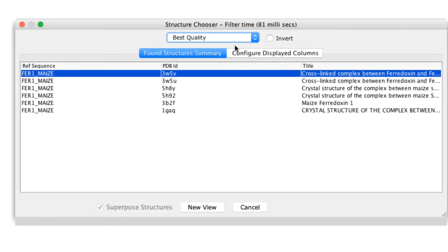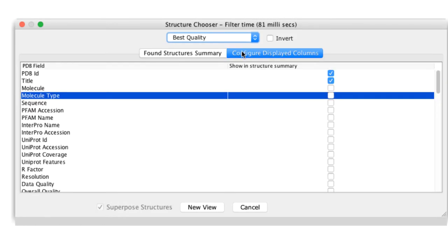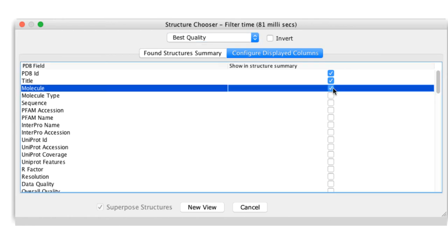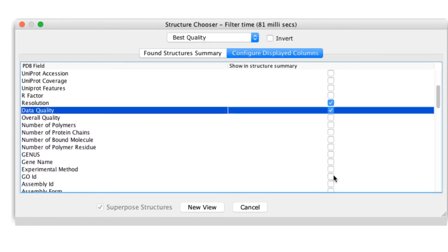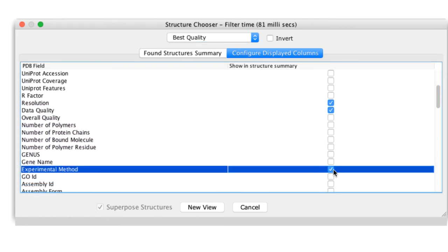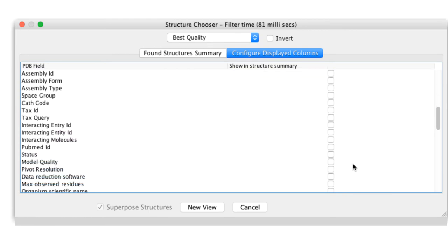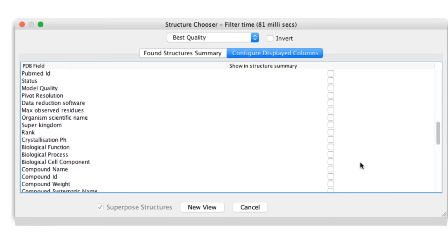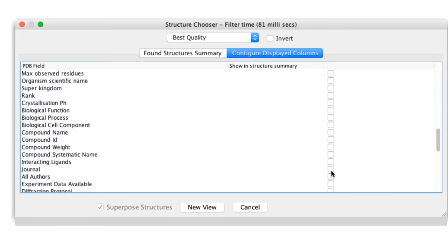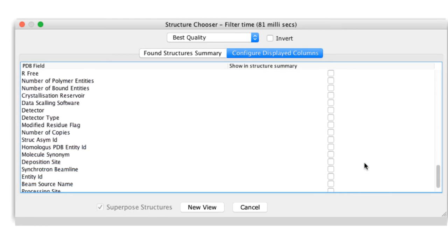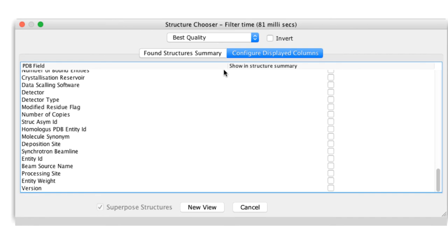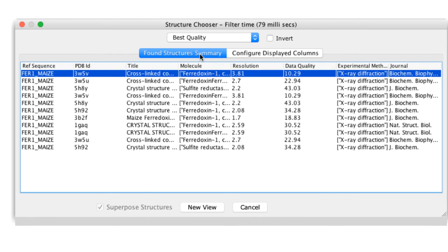It is possible to customize the structure chooser dialog box by going to the Configure Displayed Column page. Select the additional information you require by checking the appropriate boxes and return to the Found Structure Summary page.